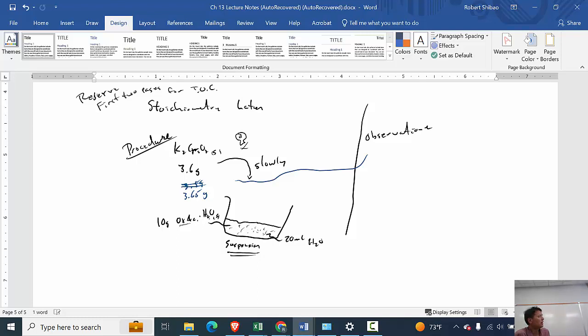Oxalic acid is a chelating agent, and you don't want it to chelate metals in your body that are needed for other functions. But anyway, going back to the dichromate, this stuff is hazardous, so be careful with this. And we add it slowly because dichromate is such a powerful oxidizer in the presence of acid. Well, we have acid present, and so this is the reaction that's going to happen.